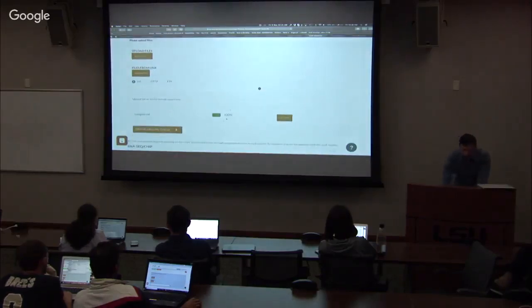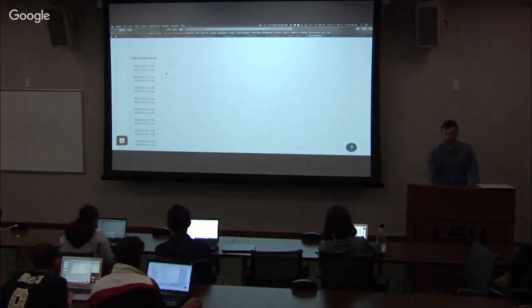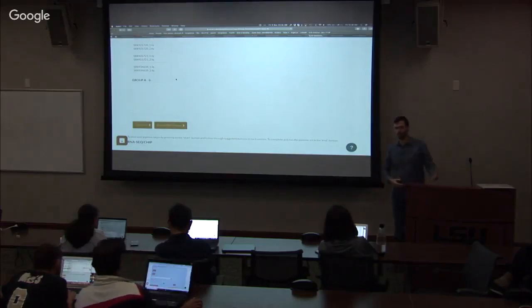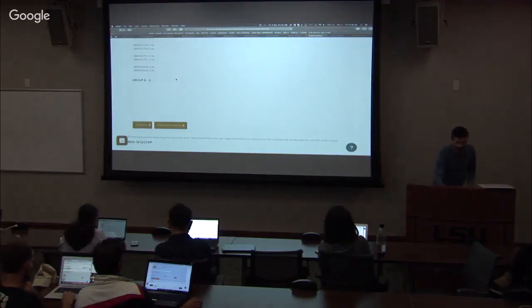So after it uploads all the way, we will press on define groups check. And this is what's inside the SVL. So you can see that these SRA archives are paired together, and you have _1 and _2 in each one. The groups are going to be useful for differential gene expression, right? So if I want to compare a number of samples versus a number of other samples in two groups, I can drag them, I can create two groups and drag them appropriately.